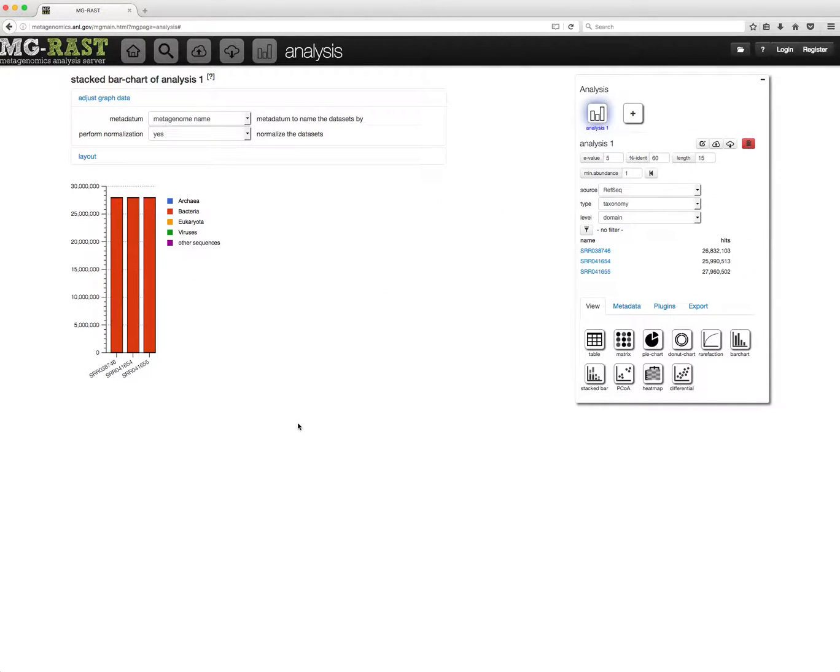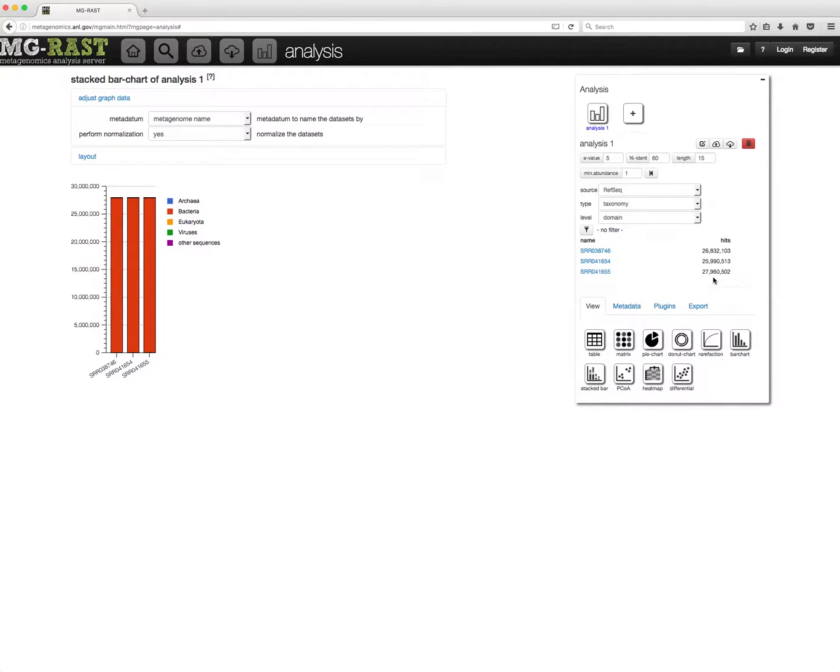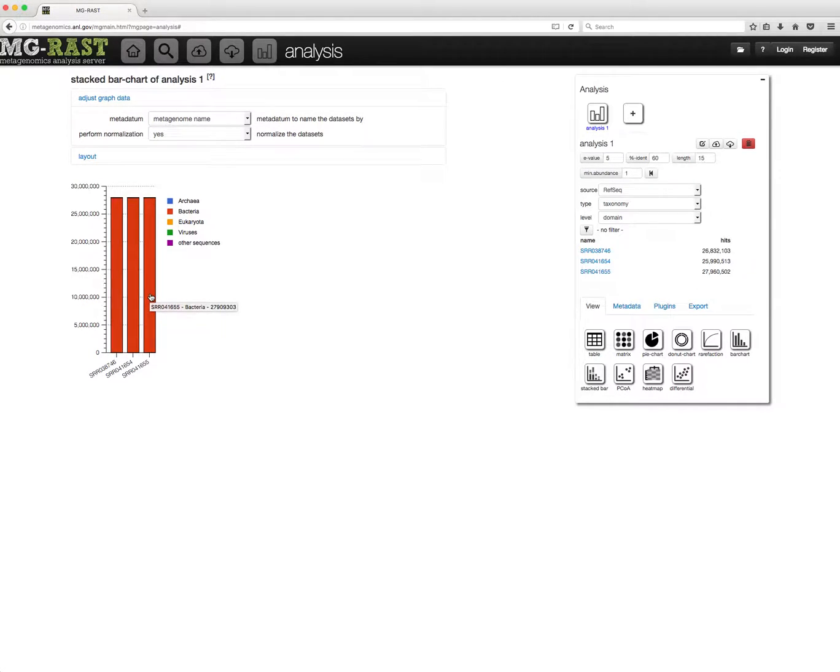As you can see, each dataset has several million hits. There are two ways to filter these hits, either drilling down by clicking on the graphic, or adding a filter via the filter icon for either taxonomic or functional categories.